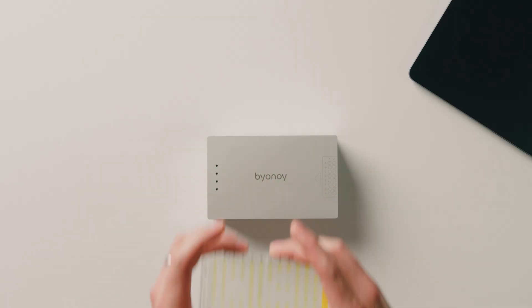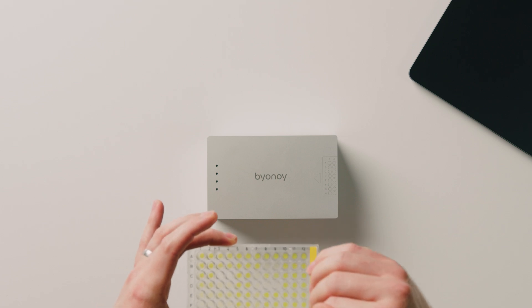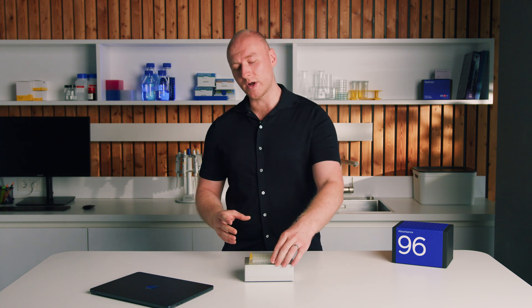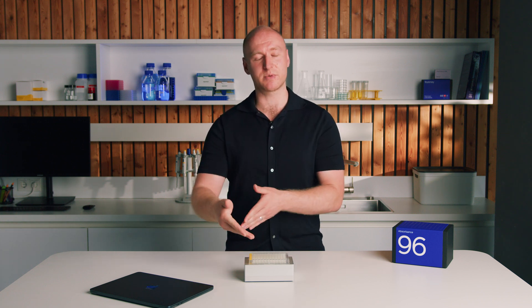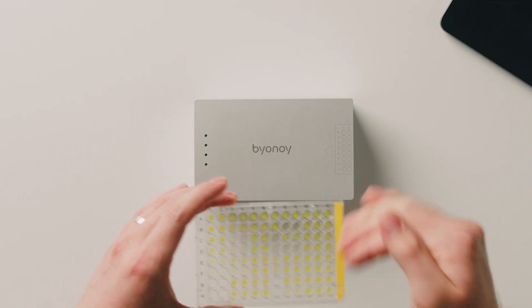You're probably familiar with this — there's the microplate reader, then some form of CD tray comes out. You put the plate on that tray, it disappears inside the instrument, and you hear some clunking noises. Basically, that CD tray mechanism moves the microplate back and forth underneath a scanning mechanism. Alternatively, the scanning mechanism itself can move across the microplate, scanning each well individually or in series of eight wells.